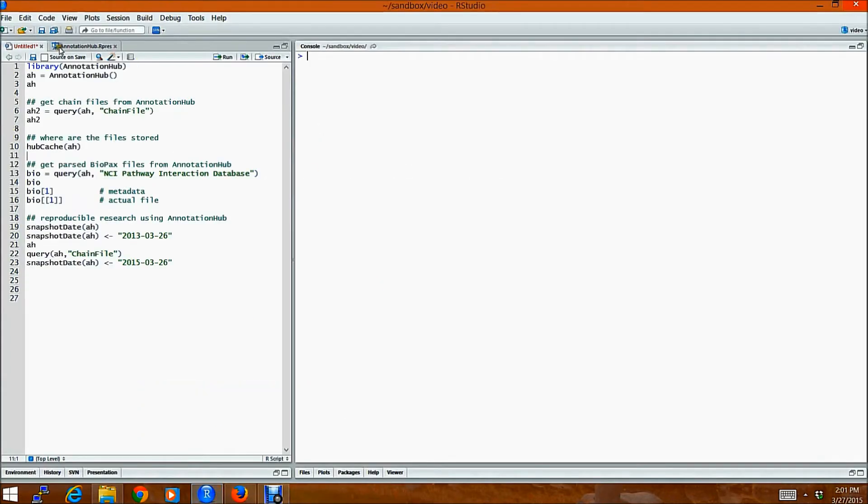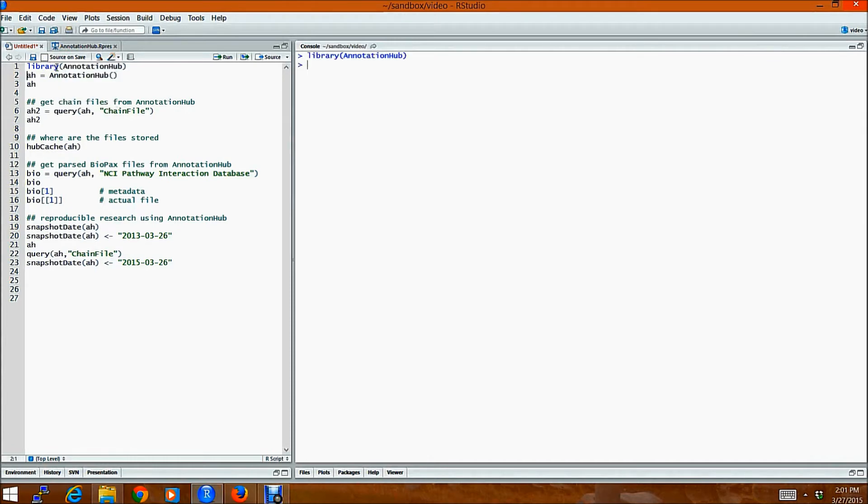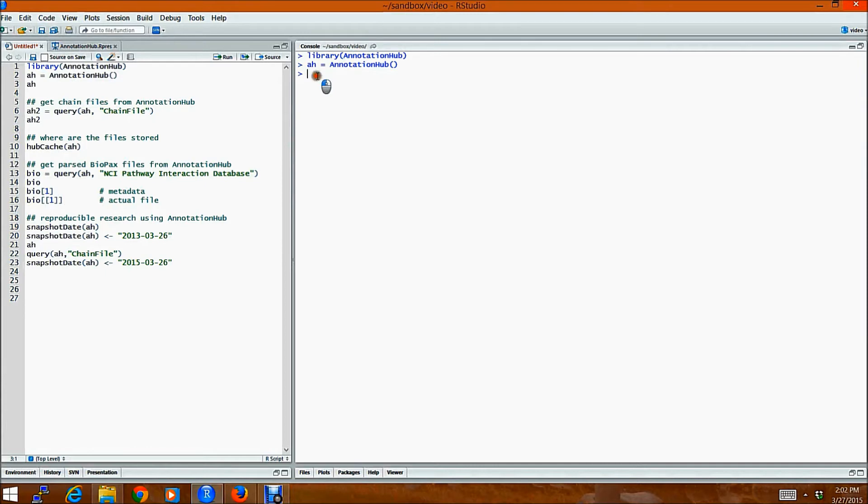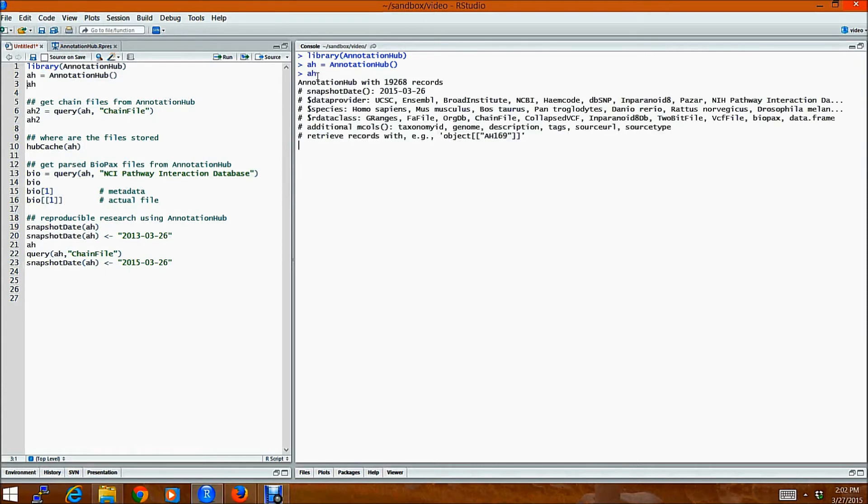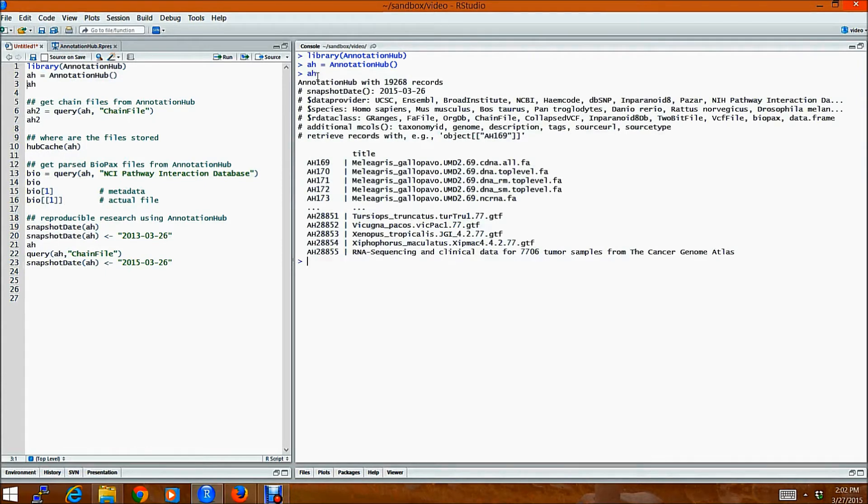So let's look at a quick tour of it. Let's load the package into our R session. Then you would download all the AnnotationHub metadata using this constructor. And let's look at the show method.